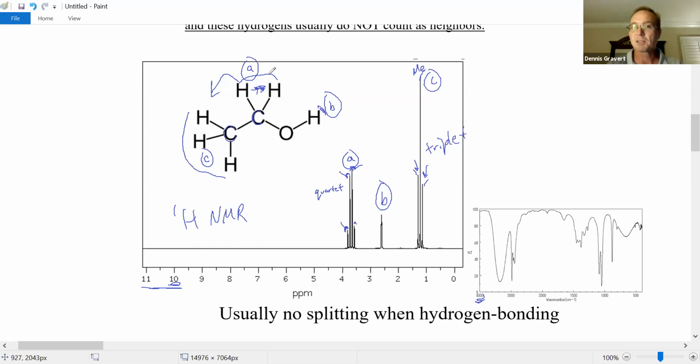But then you might say, wait, how come you're ignoring the other neighbor on the other side? I imagine hydrogen saying, oh yeah, that hydrogen, we never see him. He's off hydrogen bonding. It turns out nature has decided that hydrogens that are off hydrogen bonding don't stick around to behave as neighbors. They're never home. They're hydrogen bonding, I guess. Anyways, this is a quartet, not a quintet.